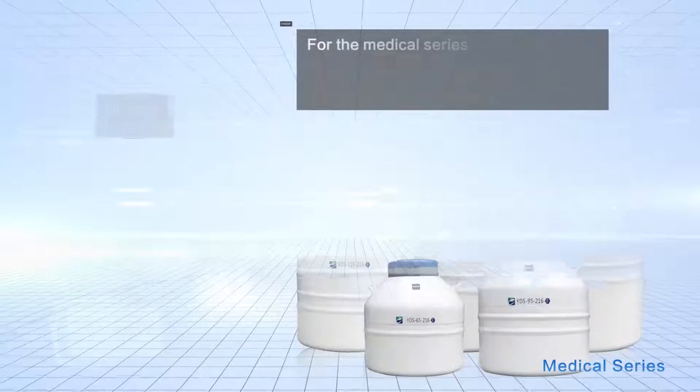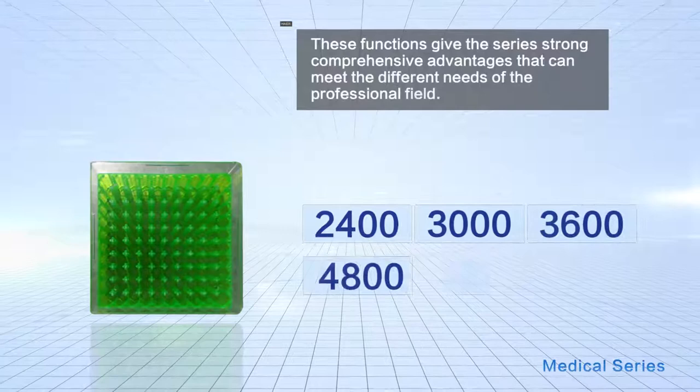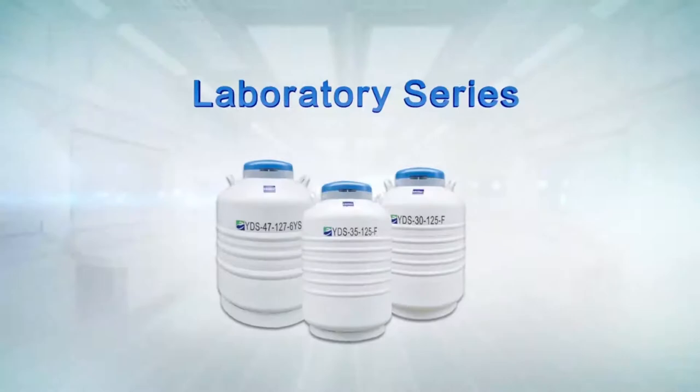For the Medical Series, by combining the functions of low liquid nitrogen consumption and medium-sized storage capacity, these functions give the series strong comprehensive advantages that can meet the different needs of the professional field.